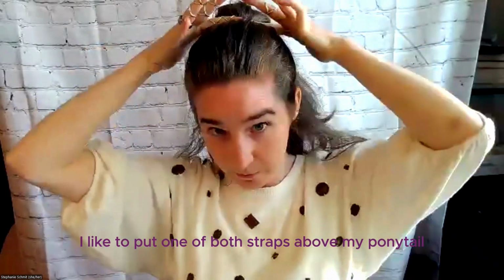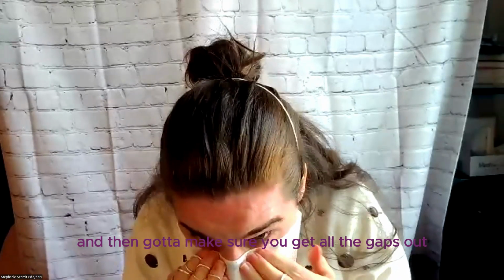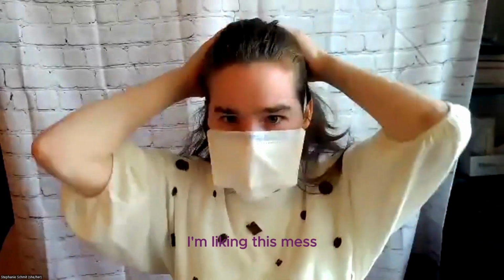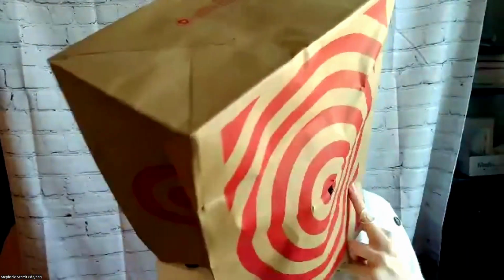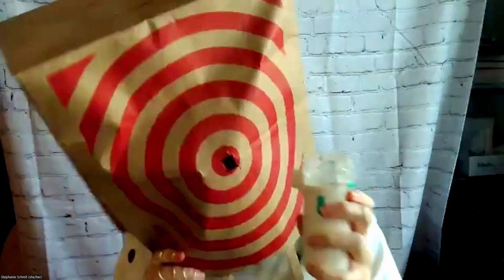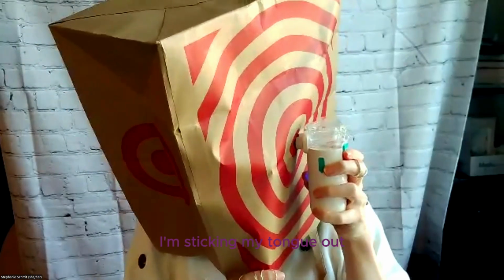So, all right, I like to put both straps above my ponytail, usually. All right, let's try it out. Oh, quite comfy so far. And then got to make sure you get all the gaps out. I'm liking this mask. Okay. Now let's see if it passes. I'm sticking my tongue out.